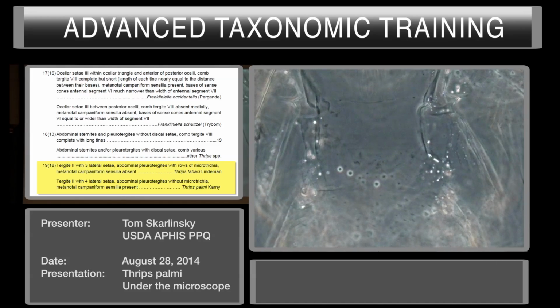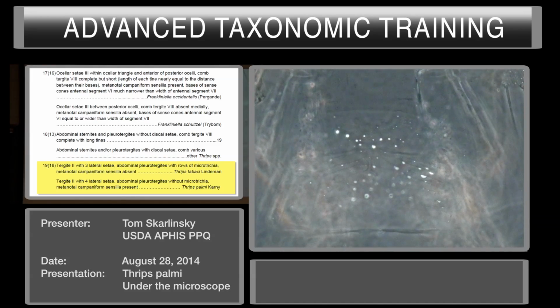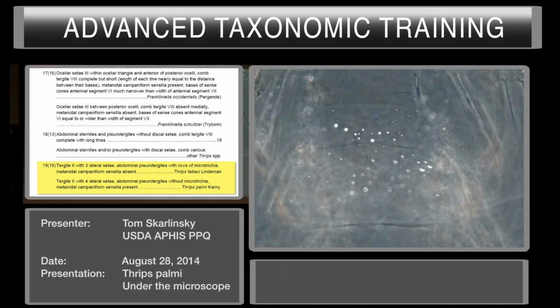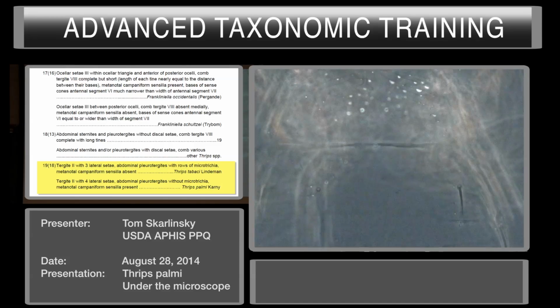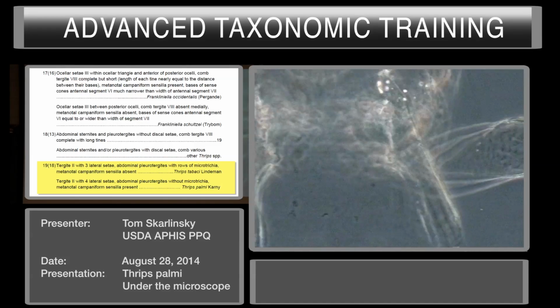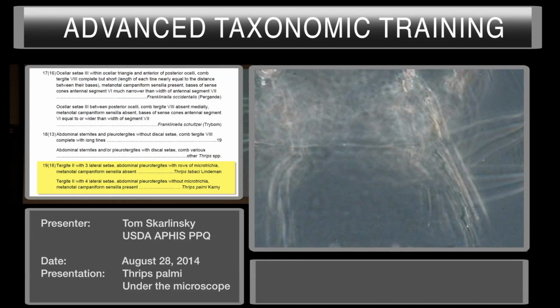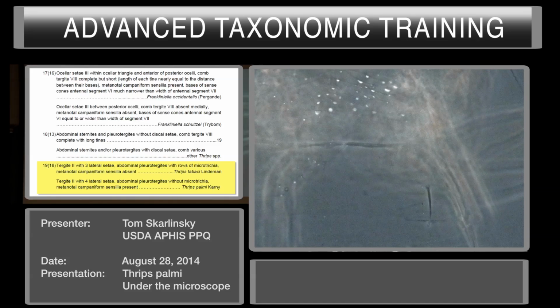Okay, so this right here is tergite 1. We need to move just a little bit further south. And now we're on tergite 2, right here.